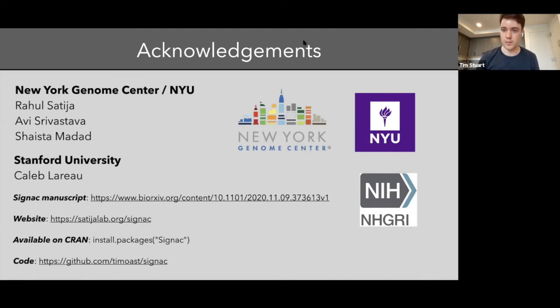There is an interesting application where you can evaluate how well these multimodal integration methods work by creating that gene activity assay and then using it for integration, and then asking, how well do you annotate the cell types compared to how you would annotate them if you use the actual gene expression. But beyond using it in that context, we typically always use the real gene expression.